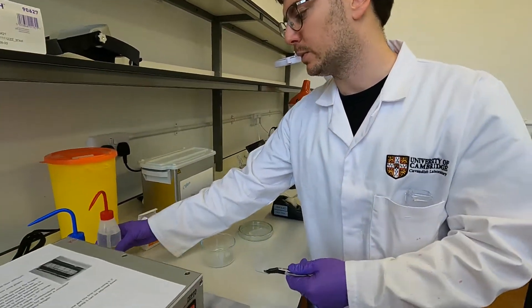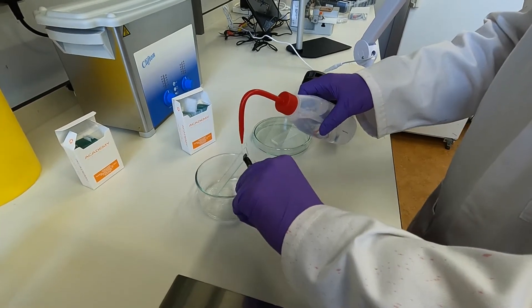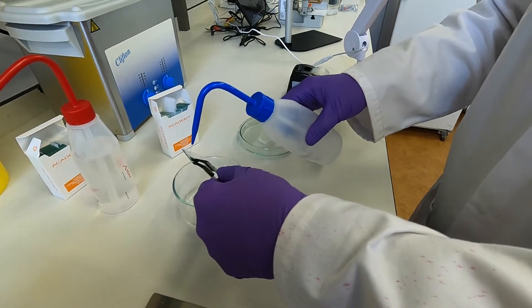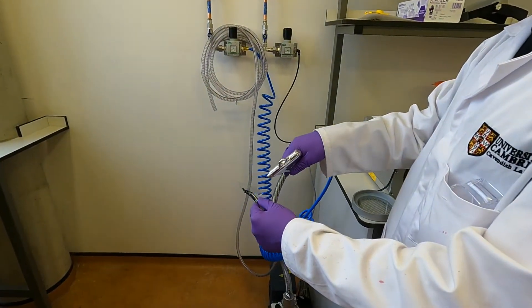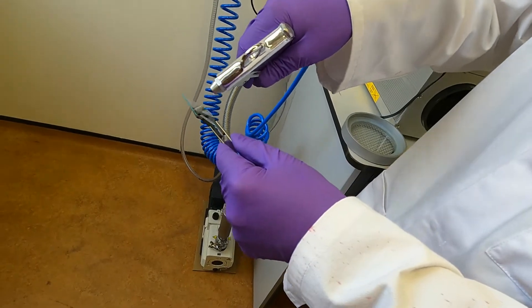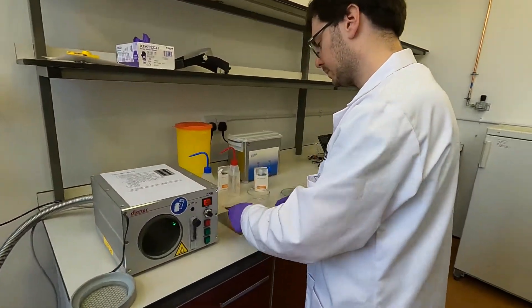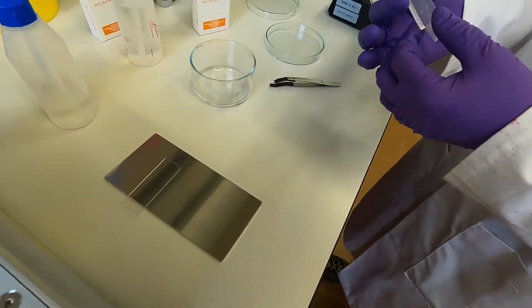I'm going to quickly rinse both sides with acetone to remove basic organic contaminants and particularly dust, which is a big enemy of this process. Then rinse with isopropanol and blow dry with the nitrogen gun on both sides. Now I place that on the aluminium plate and I'm ready to pick up the chip that I punched earlier.